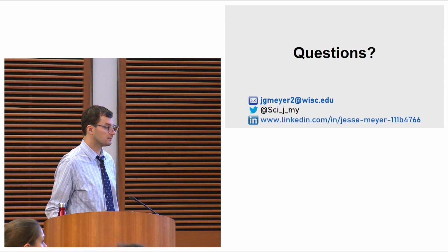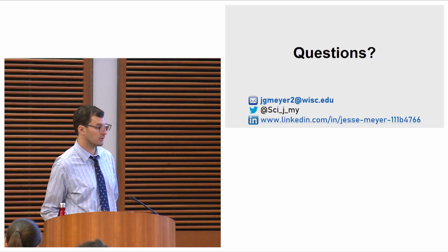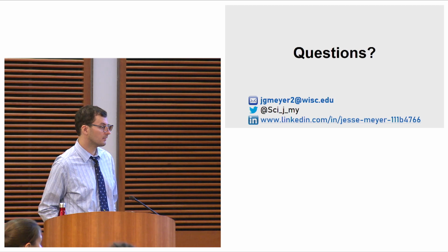Do you have an idea of the performance of these machine learning generated spectral libraries like ProSit, how that's performing? It's a very new thing, but I'm just curious to see if you've tried it. I haven't personally tried it. I know some people that are trying it, especially the guy at UC Davis, Brett Finney. He's making libraries for people if they want them, with Prosit that he's got installed locally. So you could reach out to him and get his opinion, but I think it works pretty well, actually. They showed in the paper that the spectra they generate are as good as repeat measurements of the same peptide from technical measurements. So I think it works quite well. I think it's a little early to tell, but it looks really promising and exciting.